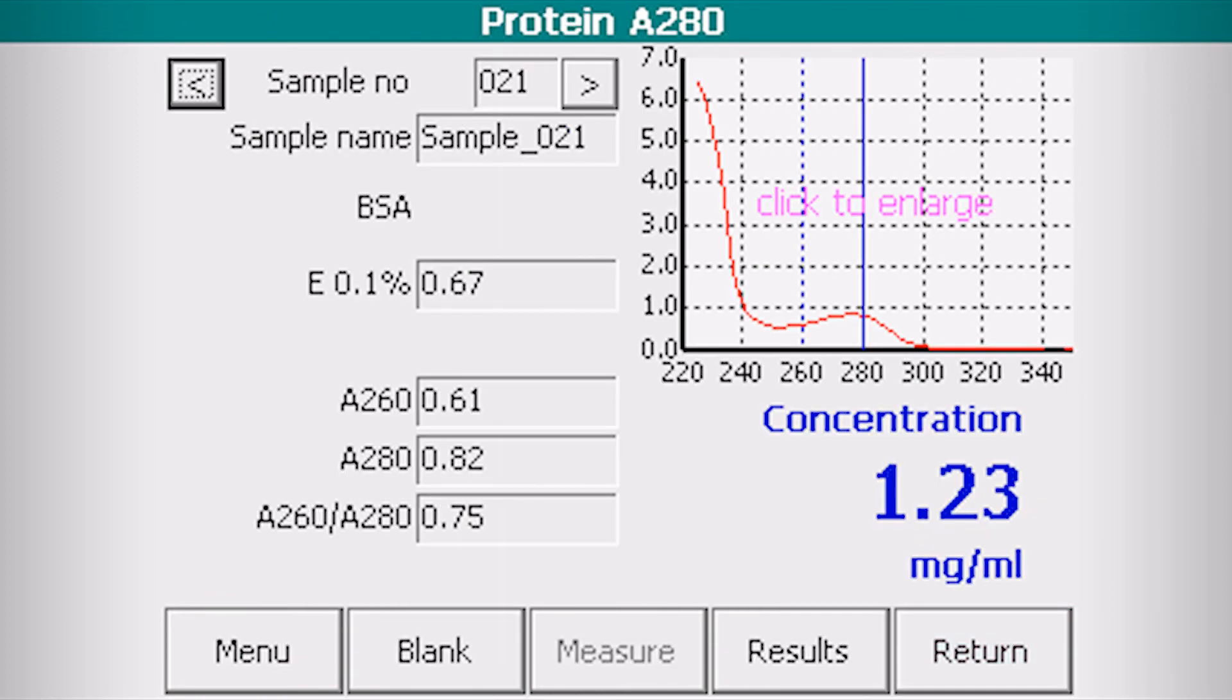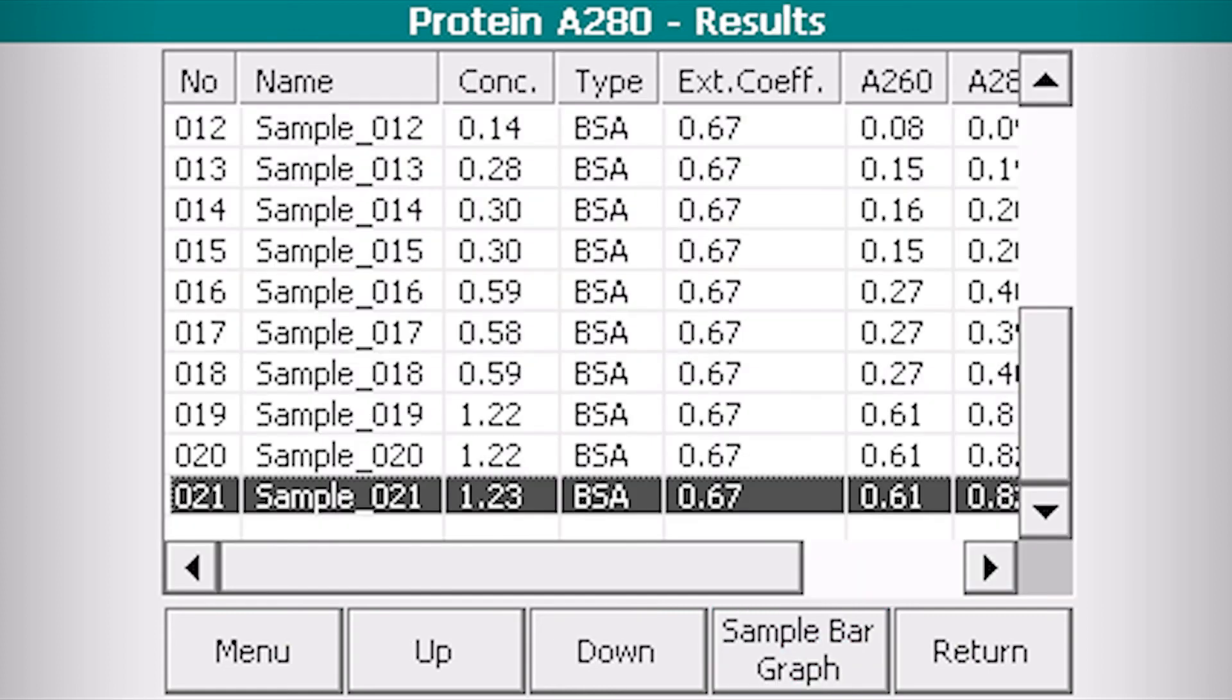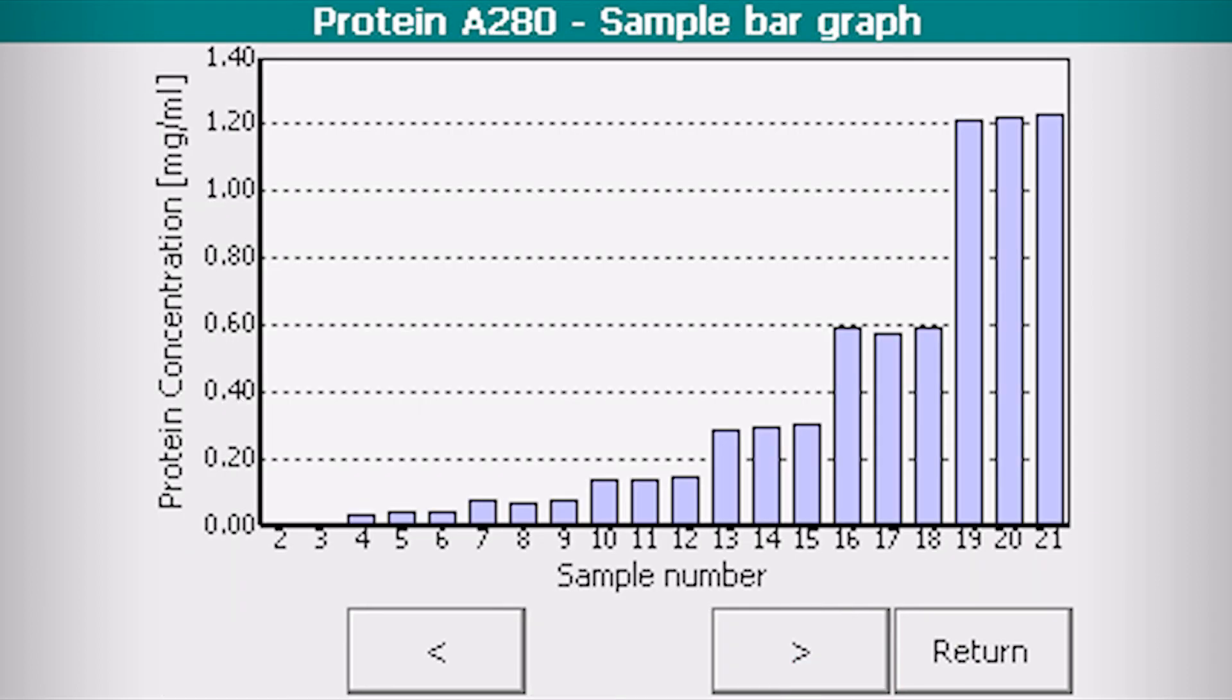Click measure to continue with more samples or click results to see the results table. Click sample bar graph for a graphical overview of your project.